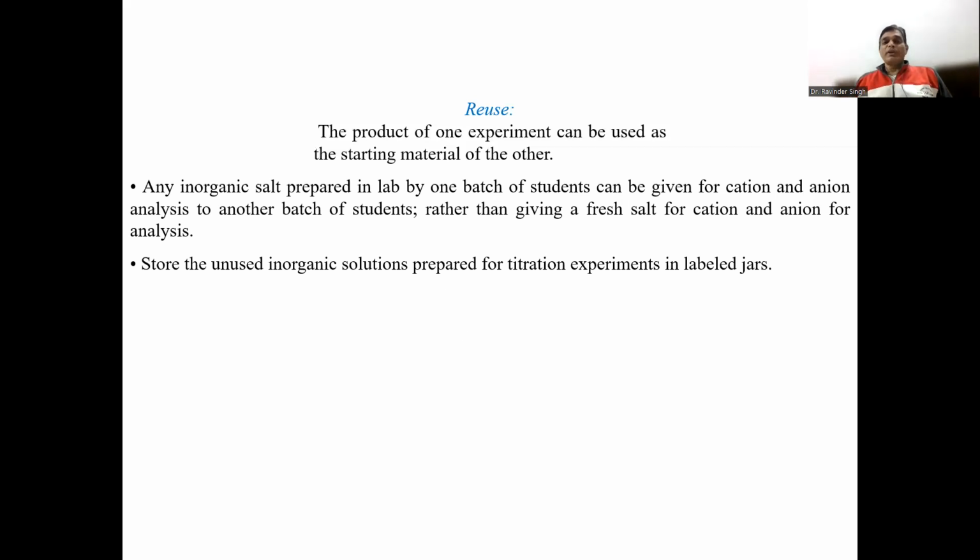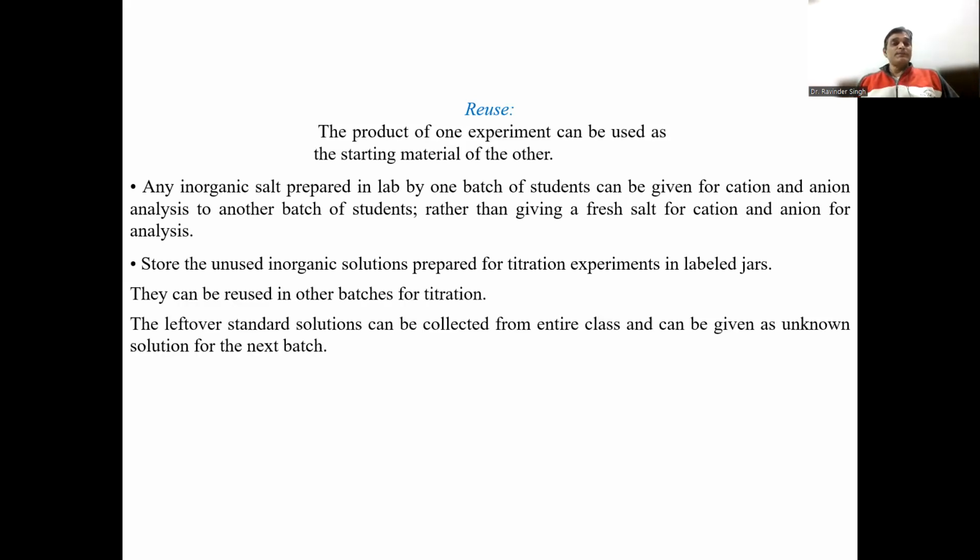Store the unused inorganic solutions prepared for the titration experiment in a labeled jar. They can be reused in other batches for the titration. The leftover standard solution can be collected from the entire class and can be given as an unknown solution for the next batch also.